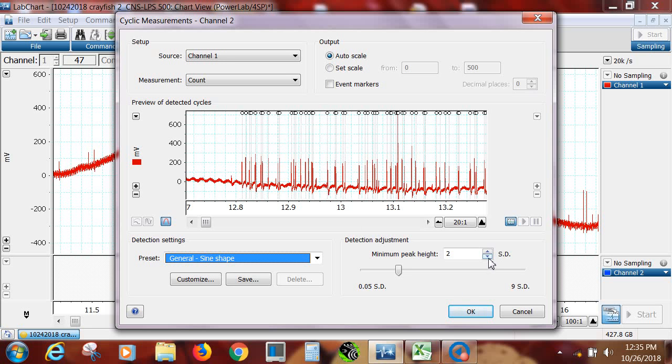We can take the standard deviation here and we can lower it. So now, if we keep lowering this, we will see in time, oh, it grabbed that one now. That one's counting. And it grabbed this one. It's counting that one. Let's go a little lower. And if we go here, now we're counting this one. So now we're pretty convinced it's not counting little noise values, but it's really counting the spikes.